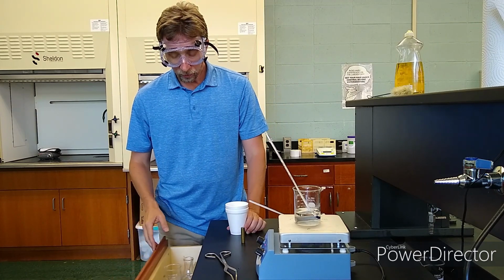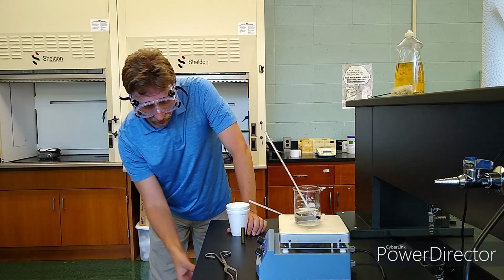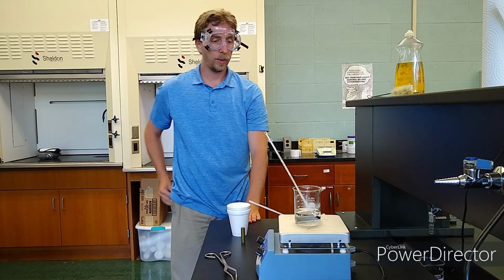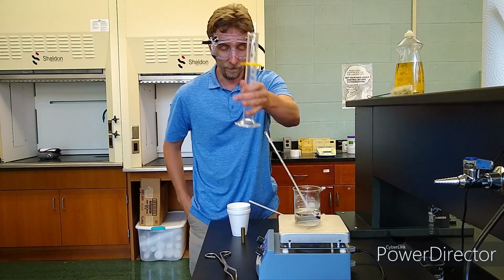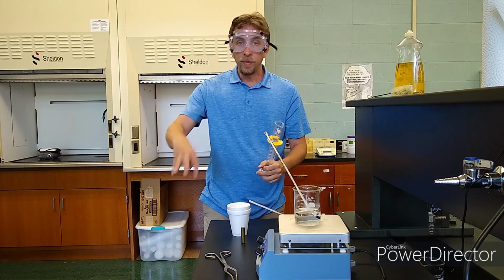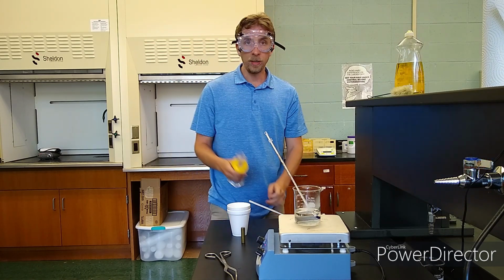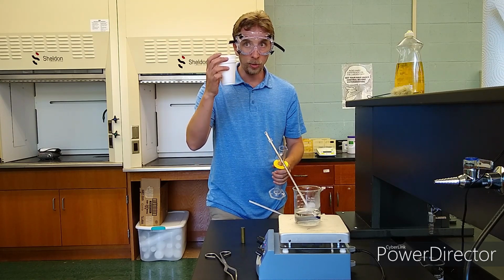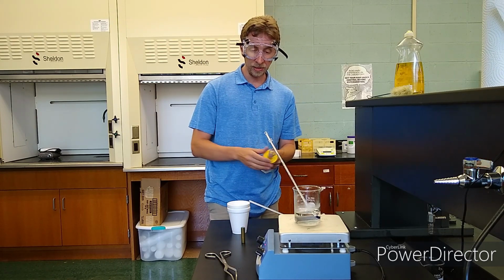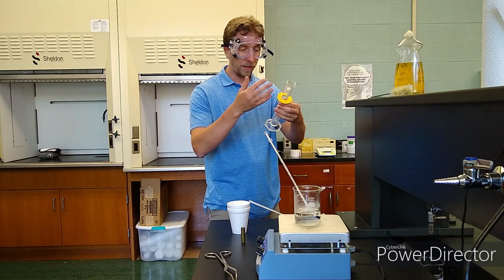The directions, if you have read through those directions, say use 100 grams, and I always say use 75 to 100. I'm looking for a nice graduated cylinder. There, I found it, 100 milliliter graduated cylinder. That allows us to get 3 significant figures if we measure below 100 milliliters, which is good to have 3 significant figures in our volume measurement. We need to know very precisely how much water is in this calorimeter in order to get good calculations to get the specific heat of the metal, in this case the aluminum. So I'm going to fill this up to between 75 and 100 milliliters.